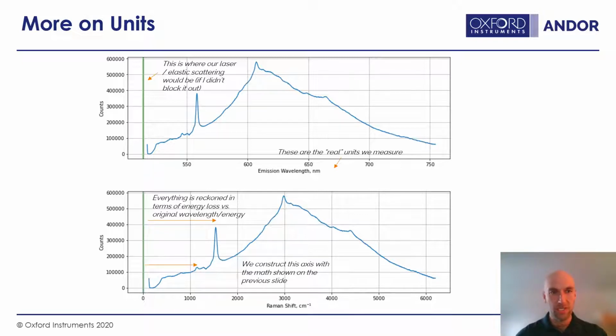So this happens to be done with 514 excitation, and there's some interesting things that happen as you move the excitation wavelength around, move it up and down in terms of wavelength, not physically up and down. Because this is now going to be invariant with different wavelengths, these Raman shifts are always the same in energy, not in wavelength. So if I were to overlap, say, a 647 excitation or a UV excitation somewhere around 230 nanometer excitation, it wouldn't overlap in wavelength, but it would overlap in Raman shift. And maybe I should have actually had one of those. That would have been neat, but next time.